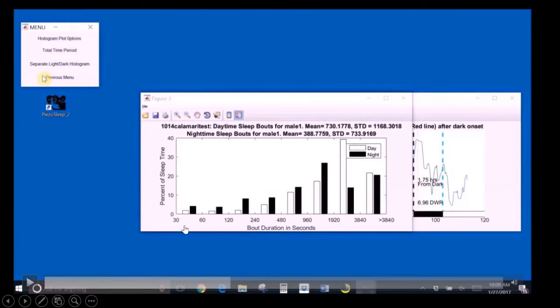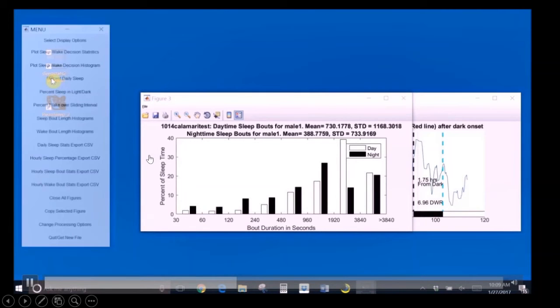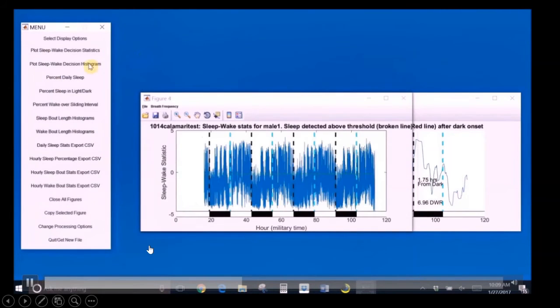And using that kind of window, you'll typically get, say, a peak of about 1,000 seconds or 17 minutes for bouts at night, and maybe twice that long during day on average. Bouts in the day are a little bit longer than night. The shape of this will look about the same. If you pick shorter, for some kinds of studies, you might want to put this at 4 seconds or 5 seconds and look at everyone. Others, this is a good default. So I'll show that in a little bit, how you can reset that.